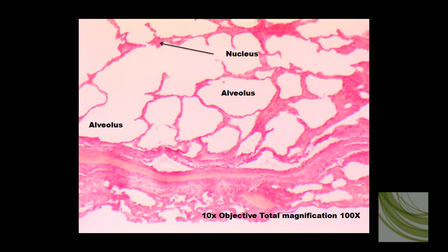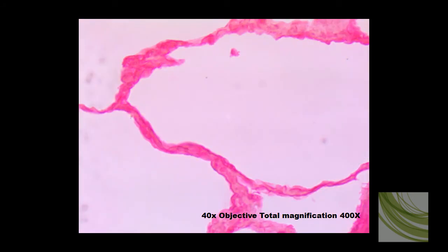At this magnification we can see a few nuclei — there's one, here are the alveoli, there's another nuclei. And by the time we get to the 40x objective, for a total magnification of 400 times, you can see individual cells with nuclei that make up this simple squamous epithelial tissue.